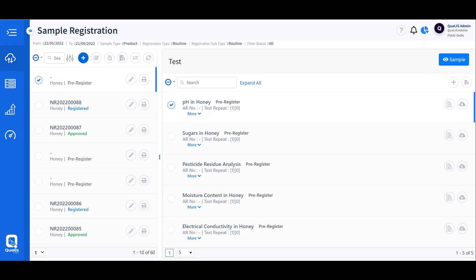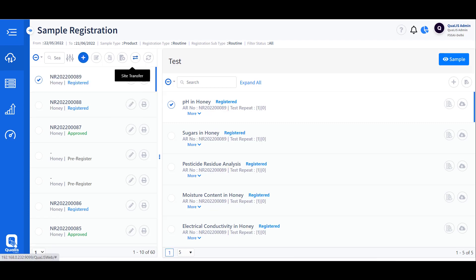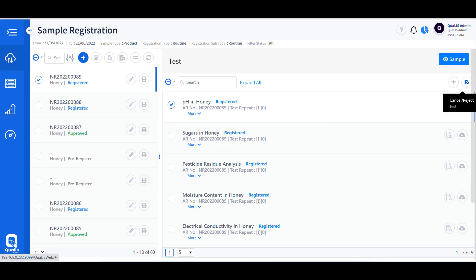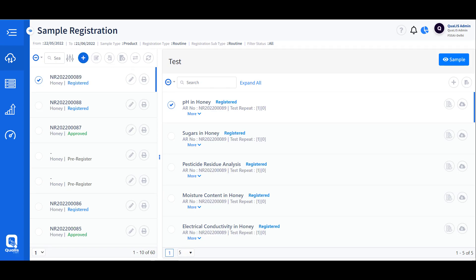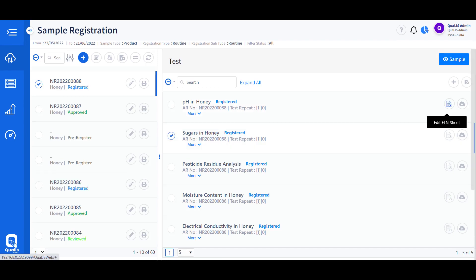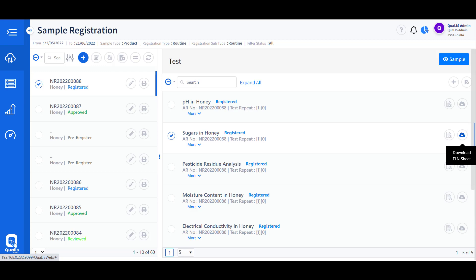The sample information can be modified at this stage. We may choose to park the sample as quarantine if it is yet to be received in the lab, or cancel the sample, or proceed by accepting it. Once the sample is accepted, it is provided with a unique identifier and moves through the predefined review and approval flow. Tests are also associated with a test data sheet for capturing specific results, which can be presented along with the final results.